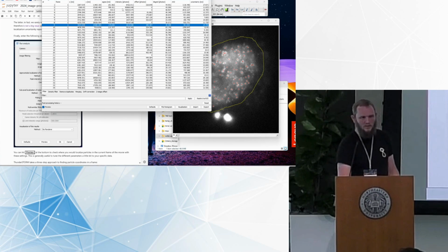This is one of the columns where it would be important to get the calibration of the camera correct for these values to make sense. Because we calibrated it correctly, it's relatively reliable. You can see that per spot we usually get thousands of photons. That's a reasonable value.